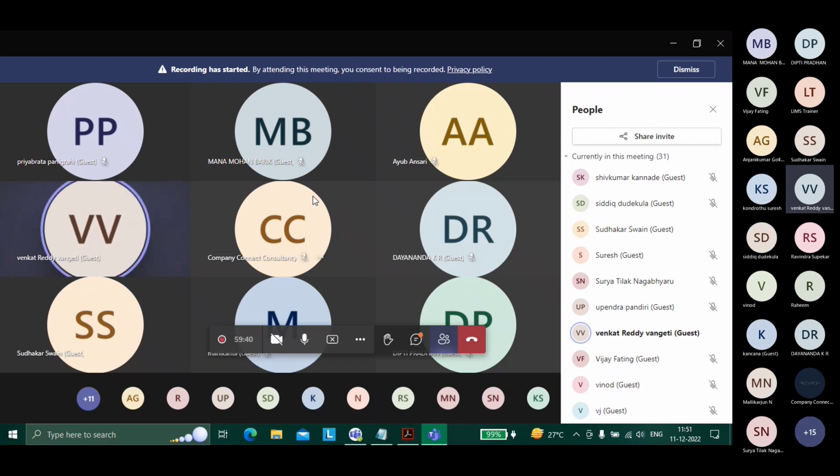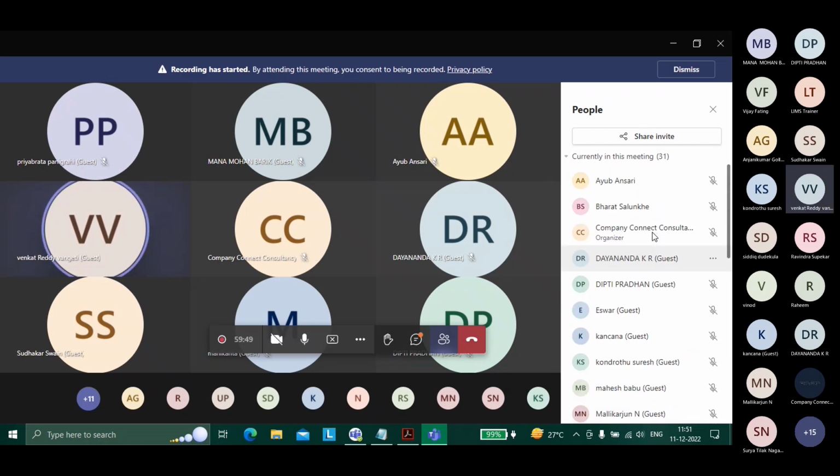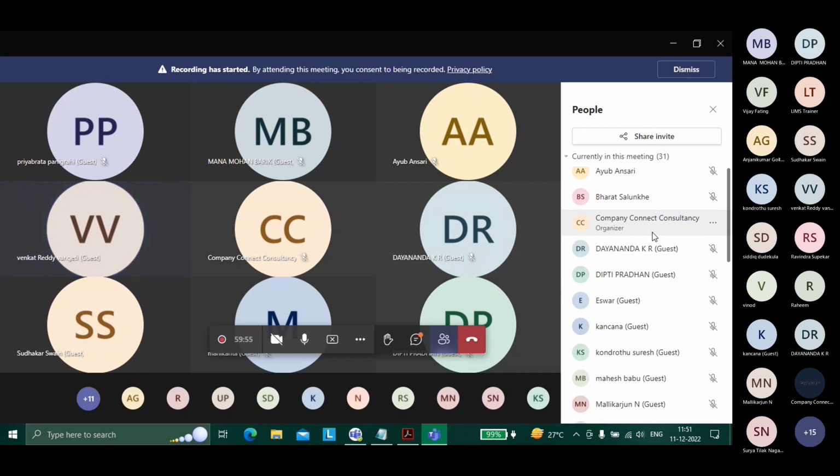Sir, what topics will we learn in this course end to end completely? Mainly we will learn how the static data is built and what the dynamic data is. Maybe the basics about some modules. We'll learn about Crystal reports, workflows, and instrument integration.